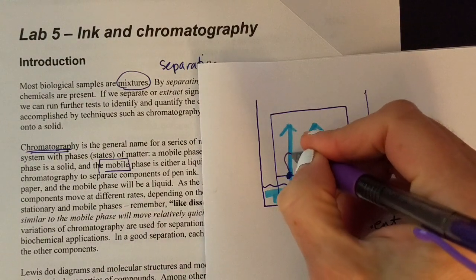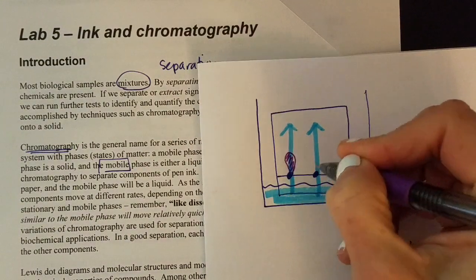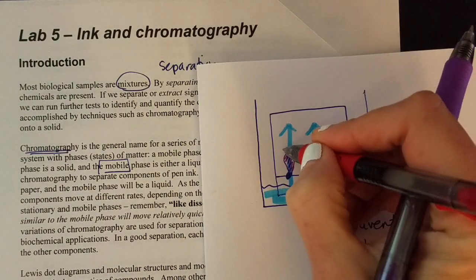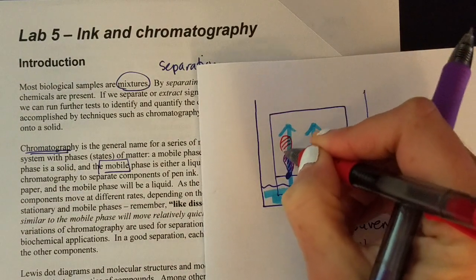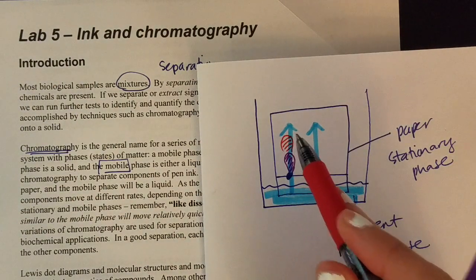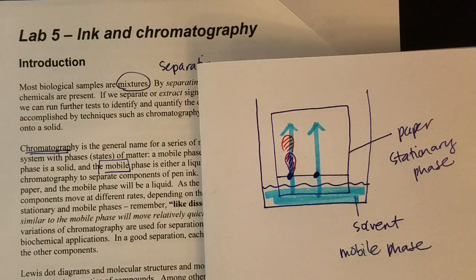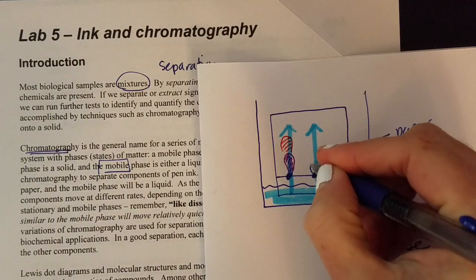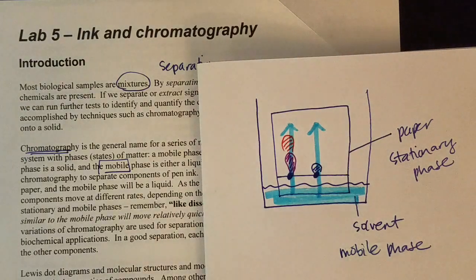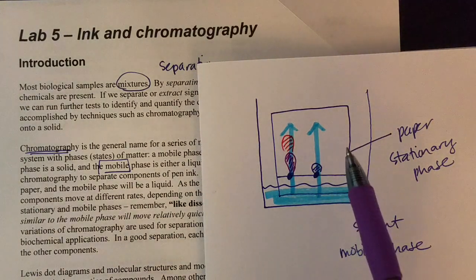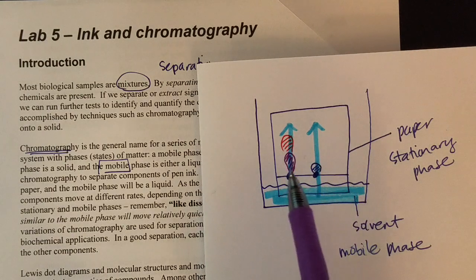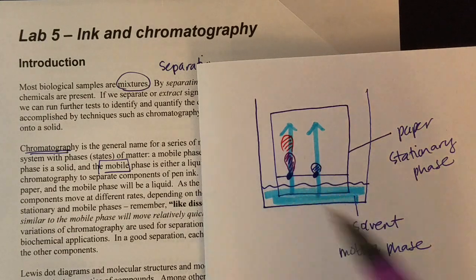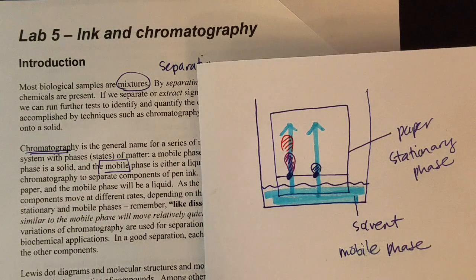So you might see say purple show up here and then a little bit of a red spot up here. So this blue ink might actually be made of a couple of different pigments, maybe a pigment that doesn't move very much. You might just see a little bit of a blue smear. So this would be a good comparison between the two inks because you can tell them apart. And that's a big thing we want in chromatography is different outcomes.